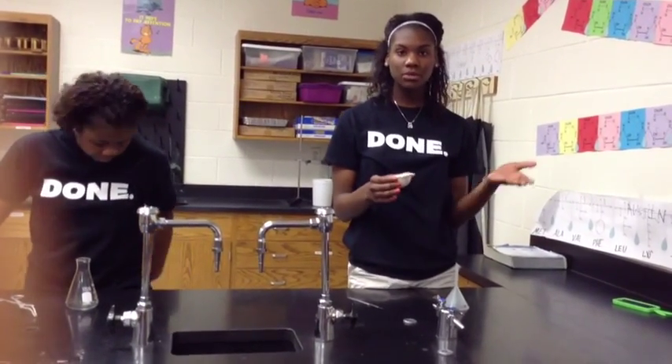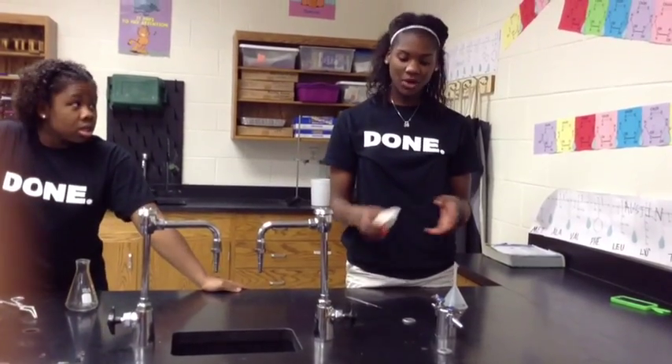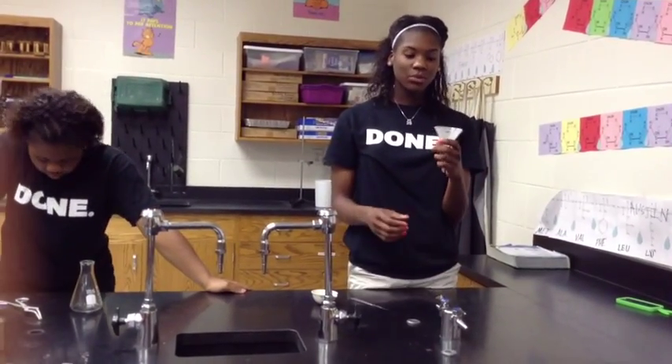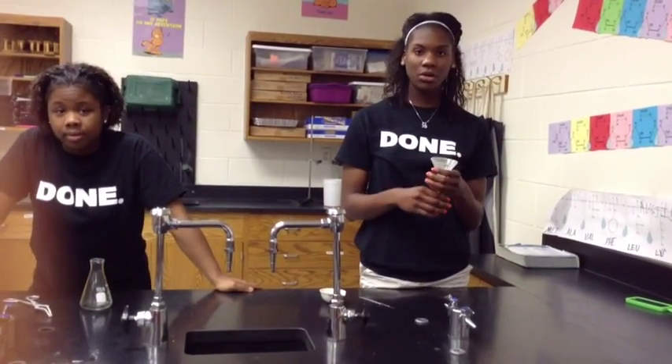Next, we have an evaporating dish where you can dry materials. Place wet substances, put it on a hot plate — the water evaporates into the air, making it drier. And finally, we have a funnel that you place certain substances into, and it filters into a bigger or smaller container.